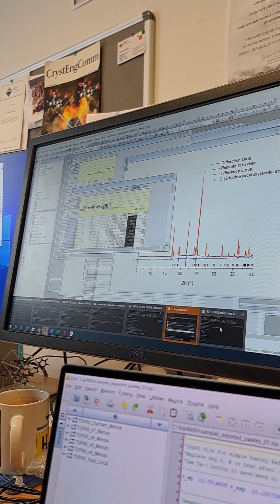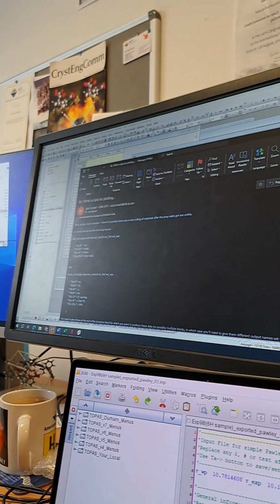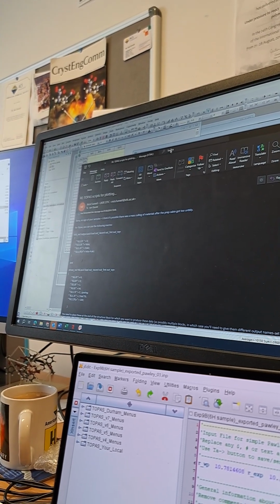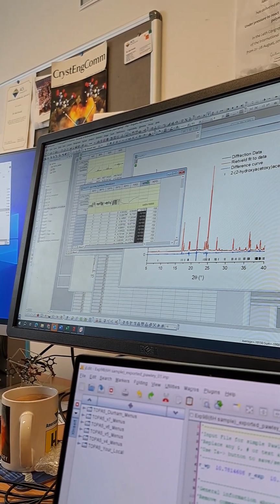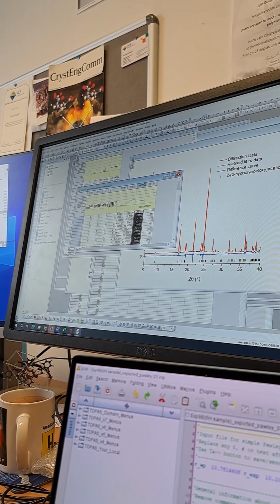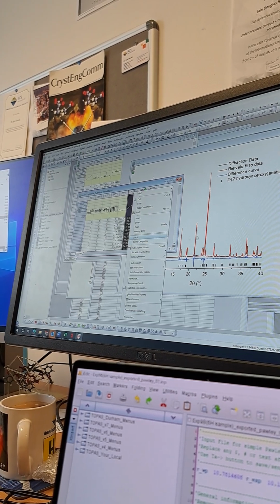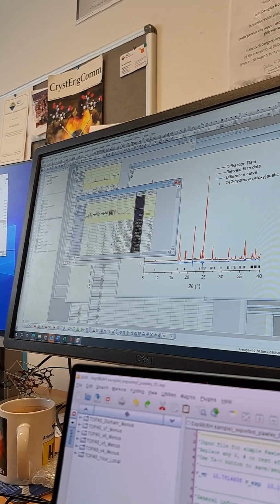So this is the second component, this phase out. You can see that's HKL, it's called HKL ASCII. As long as these ASCII files are named differently, that's fine. But essentially what we have here is HKLM, then we've got our d-spacing, 2 theta value, and then some sort of y coordinate. Now what you'll need to make sure is that you change your F column to be X. So set as X, because that's going to be your X coordinate. And then it's up to you how you deal with this.